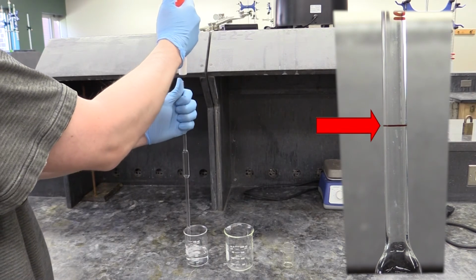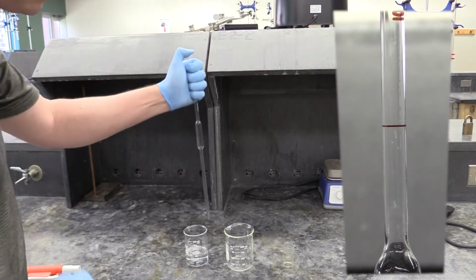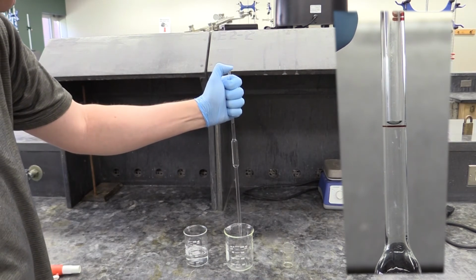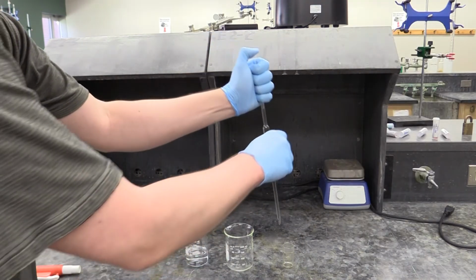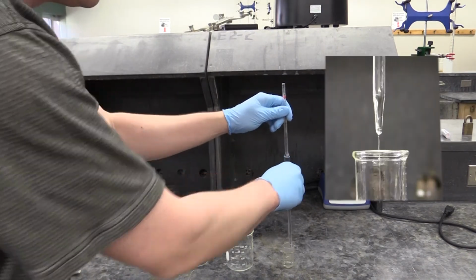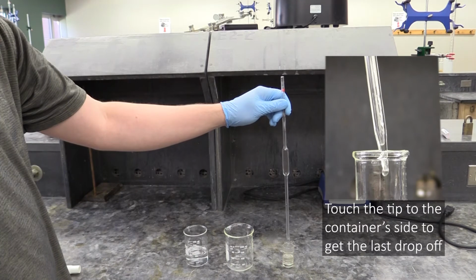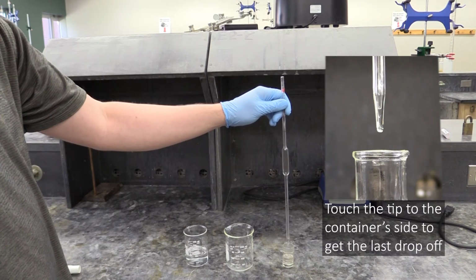You then take the pump off and use your thumb or finger to hold the liquid up, then let it drain back down to the line. To dispense the liquid, hold the pipette over the container you need to get the liquid into and let it gravity drain. When it's done, touch the tip to the side of the container to get the last drop off.